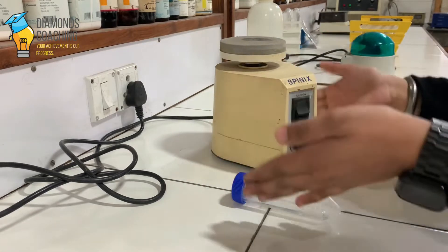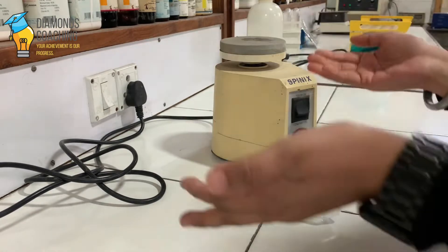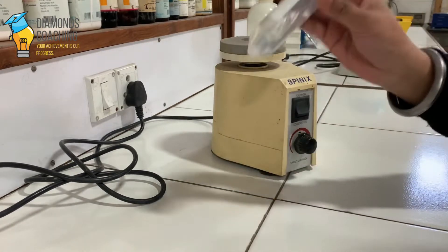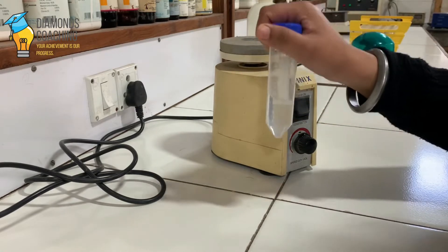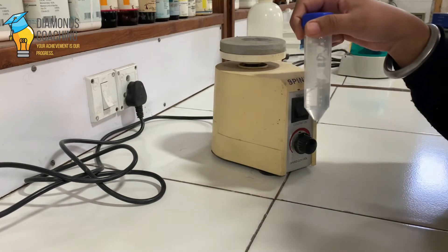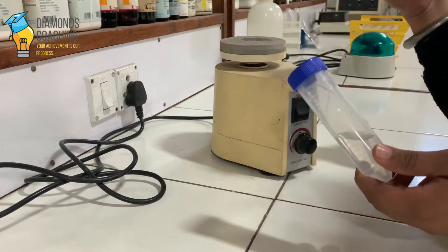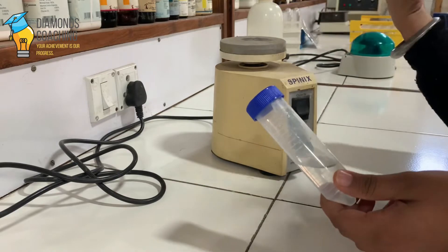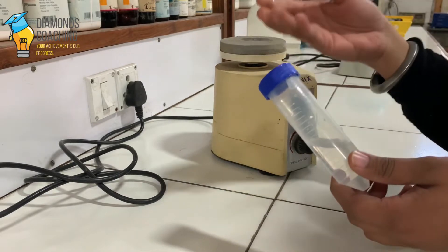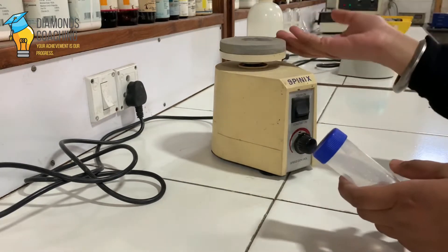This is a little apparatus which is a vortex shaker where we use these kinds of small vials to mix the ingredients or any chemicals of any experiment we are doing or carrying. So let's begin - how does it work?